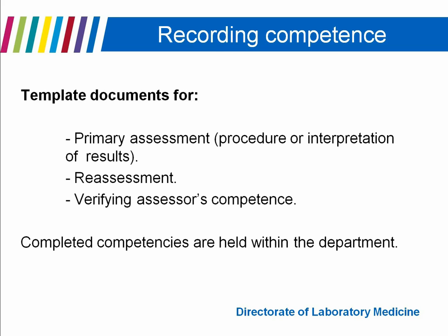And the completed documents are held within the department as a permanent record. They are accessible for staff, so if staff want to take a copy for the CPD folder, they're entitled to do that. But we keep them locked away in a filing cabinet.